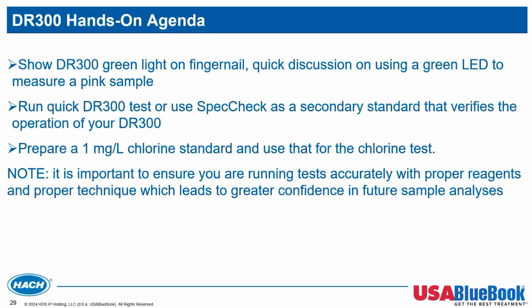So yeah, again, that's one quick way to find out that we're using a green light for this kind of test to measure our pink sample that we produce. Now is normally a time when I would talk about complementary colors. That green is the complementary color to pink, and that's why we're using a green LED. And you can imagine if you buy a different type of analyzer, you're going to be using a slightly different LED, perhaps, with your different colorimeters there.